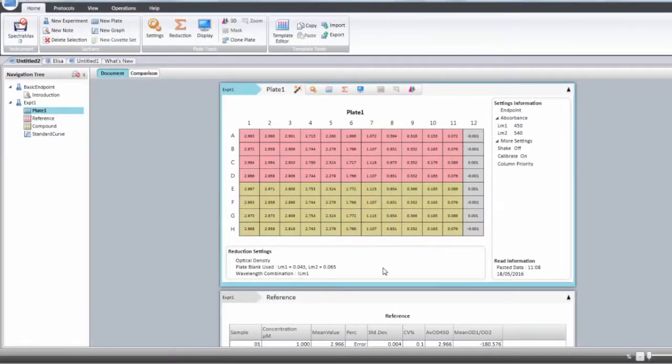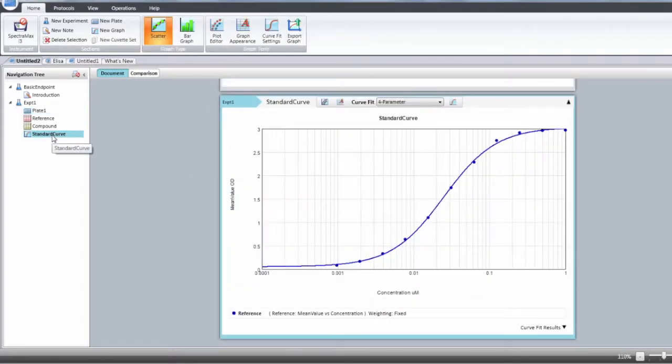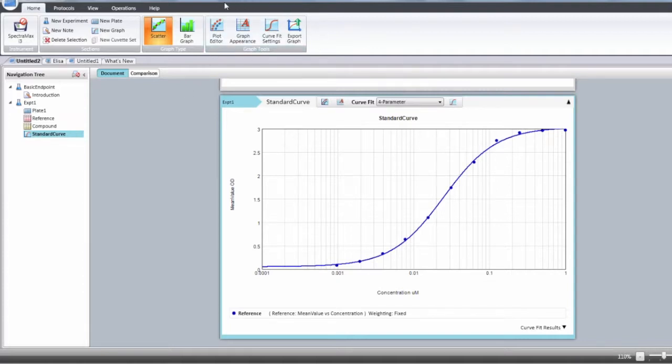So in order to modify your graph, you have to select the graph section in the navigation tree. You're going to be able to modify that graph from the top menu in SoftMax Pro or from the menu within the graph section.